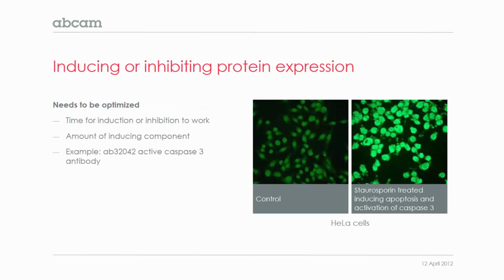Moving on, we're going to take a further look here at inducing or inhibiting your protein expression. If you want to induce or inhibit your protein expression, there are various things that may need to be optimized. You will need to give time for the induction or inhibition to work, and you will need to optimize the amount of inducing component as well.